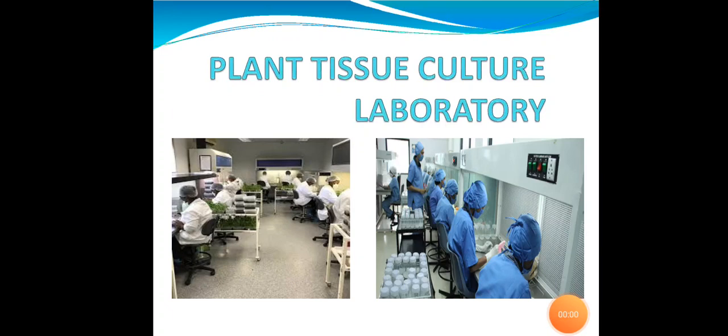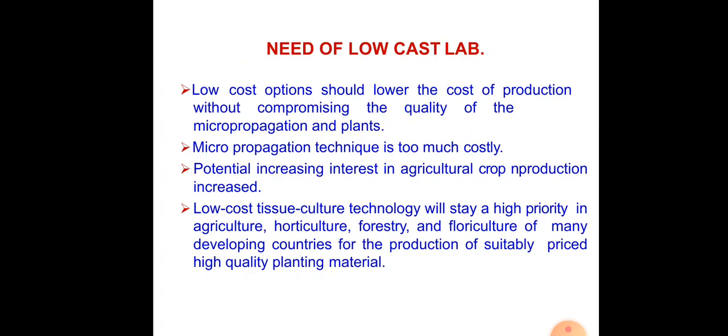Yeah, in this class, we will discuss the plant tissue culture laboratory. You know that the plant tissue culture laboratory is an important laboratory of plant science. Now, in this slide, we can see the need for a low cost lab, because we don't want to invest too much in the lab, so we are going to construct a low cost lab for plant tissue culture.